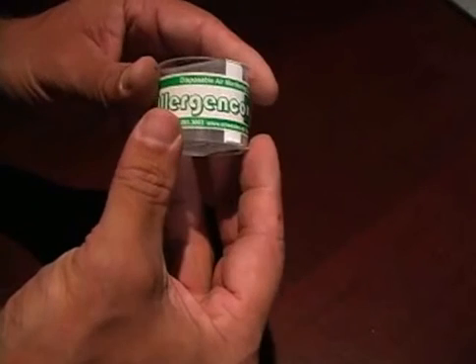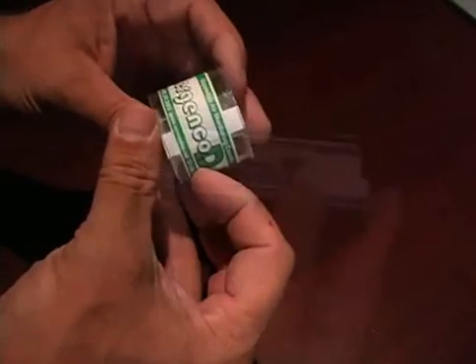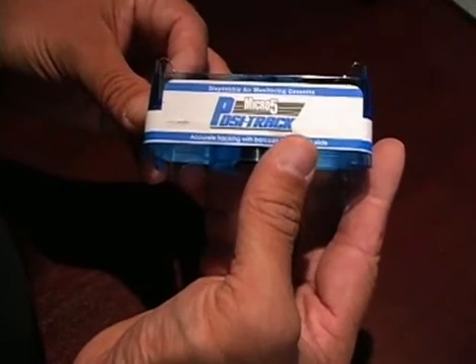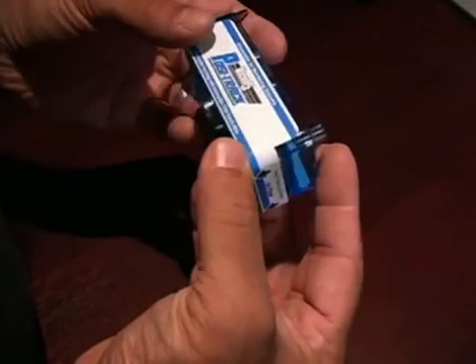This is the Micro 5 PosiTrack. Air sampling pumps should be at a flow rate of 5 liters per minute through this cassette, and at the breathing height, again, 3 to 6 feet. Around 5 feet is good.